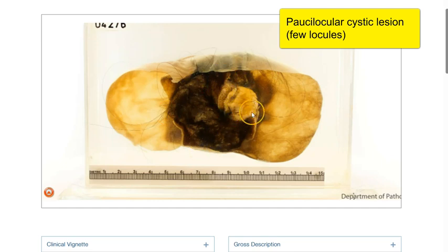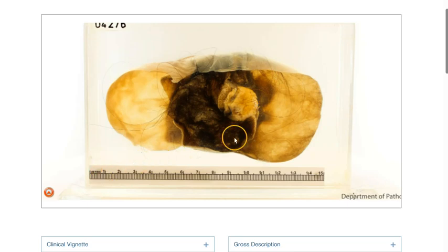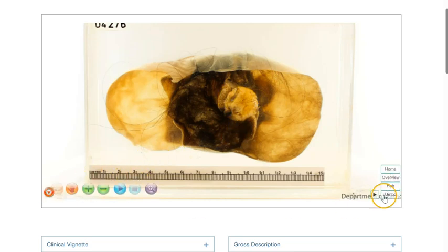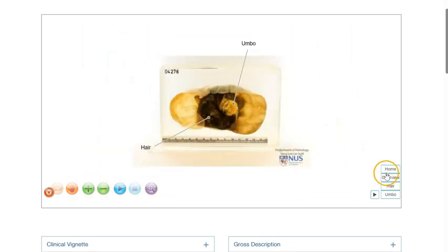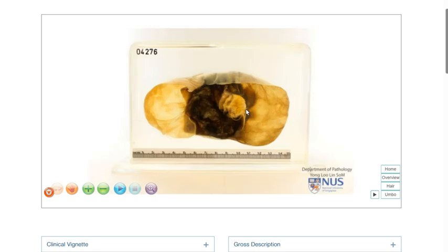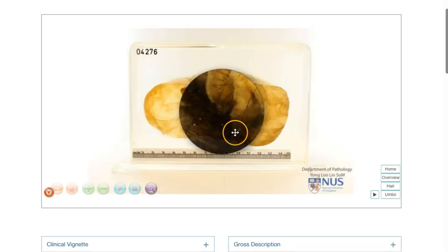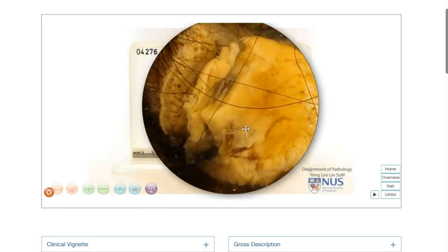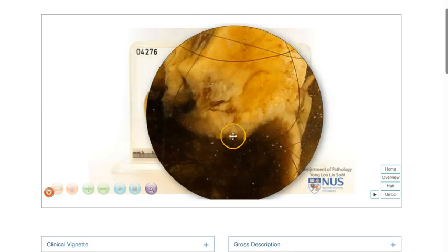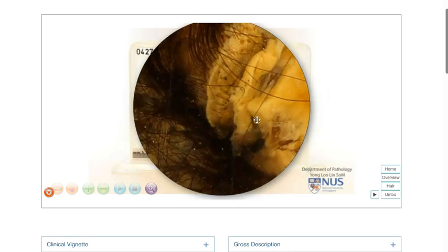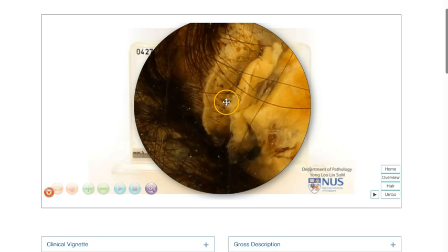In the middle locule, we can see that there is a solid area. Let me just reveal the labels. This solid area is known as the umbo. When we look more closely, this umbo appears to be covered by something that resembles skin.